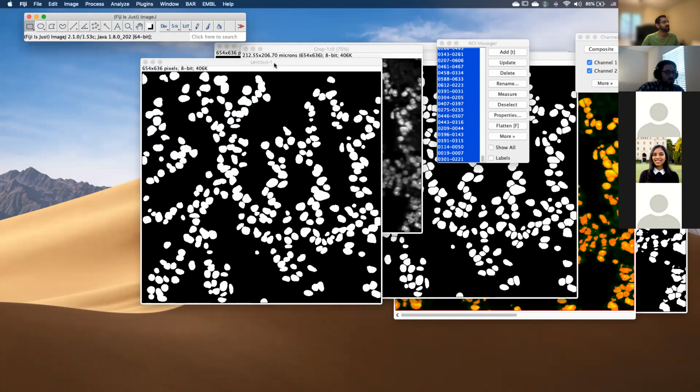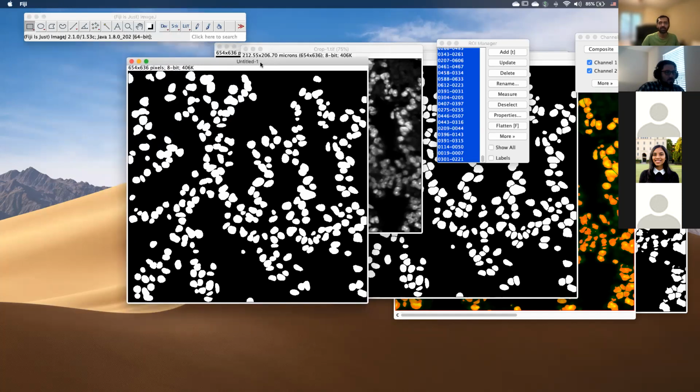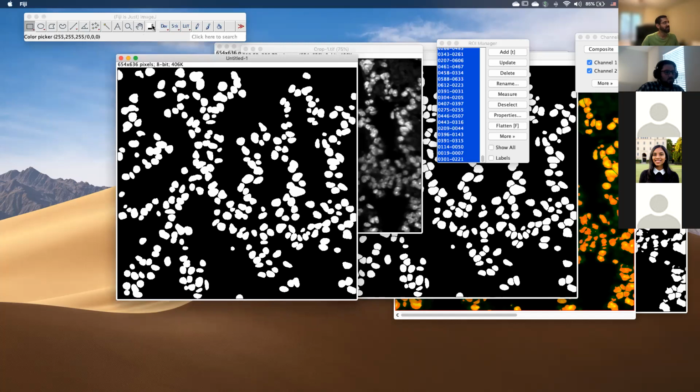Now it's still complaining about the picture not being an 8-bit binary image, which is a little bit ridiculous. I mean, it does say it's 8-bit, but I don't know why your image is not binary. Stern, does your image give you binary when you do this? Yeah, I'm having trouble recreating the problem.